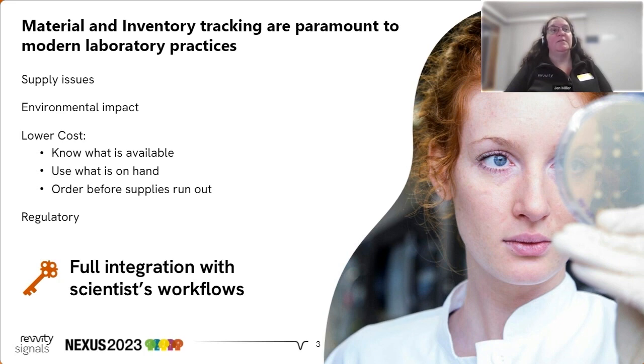Historically, keeping track of materials in an up-to-date inventory has been a challenge. Asking scientists to log into multiple software systems to do the work that is secondary to their objective is prone to error. With Signals, we've taken a different approach. We believe that by having the materials and inventory upkeep directly in the scientist's workflow, we can reduce the overhead of keeping these systems up to date and bring more value to the organization and to the scientists.